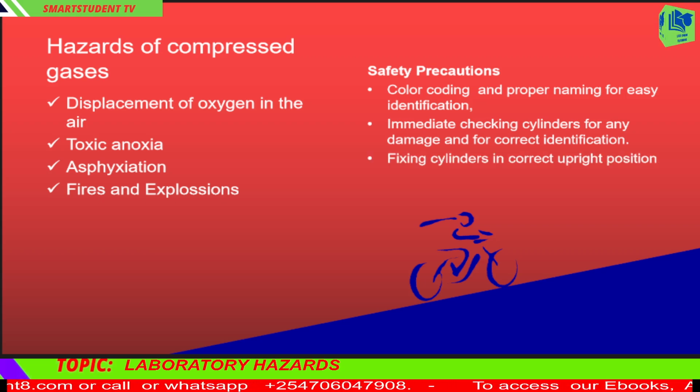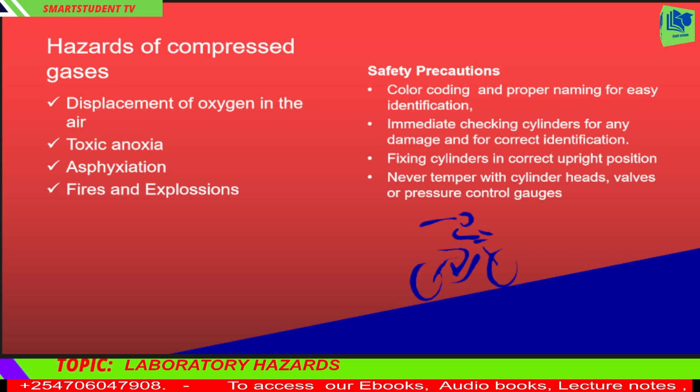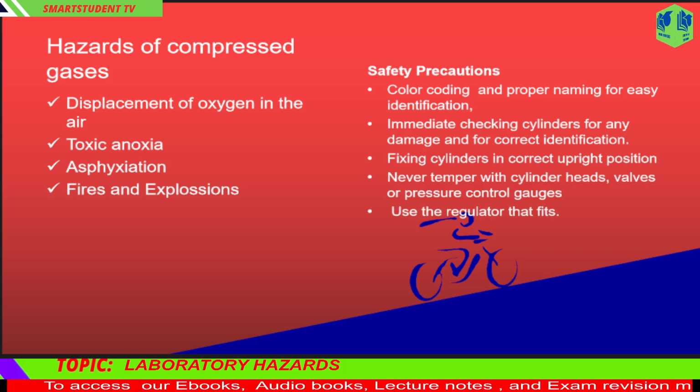4. Cylinders should be fixed in an upright position. 5. Never tamper with cylinder heads, valves, or pressure control gauges, or any cylinder safety device, or attempt to use a regulator that is not designed for use with the gas you are using. 6. Never use an adapter to make a regulator fit your cylinder.